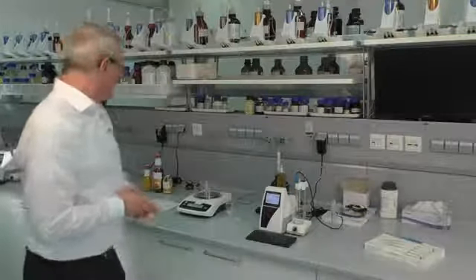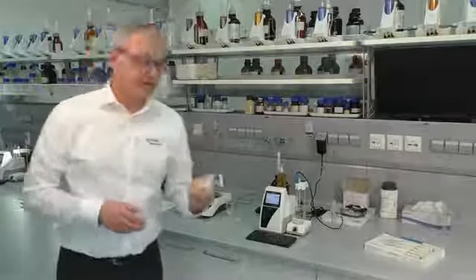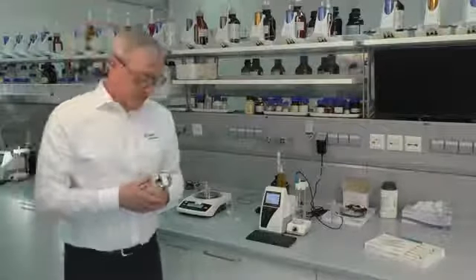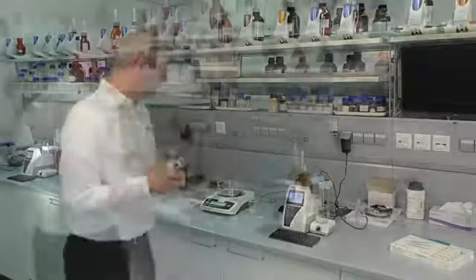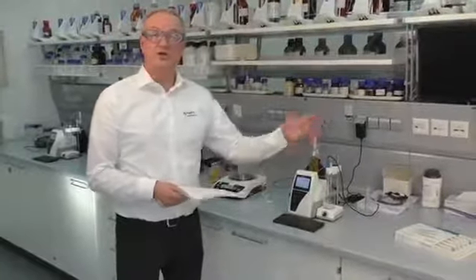In another video we showed you the titration of total acidity in fruit juice, and now we will show you something different. We want to titrate the acidity in a mayonnaise, not a liquid. It's a more solid sample, and the difference is we don't have citric acid as in a juice. We have vinegar, acetic acid, in the sample. We will use the same standard method as we use for the juice, but we will change the parameters.